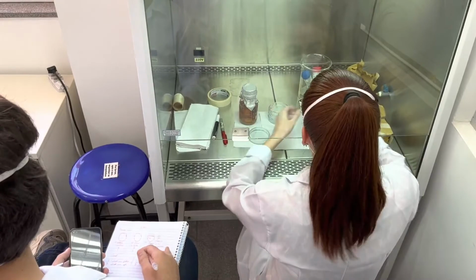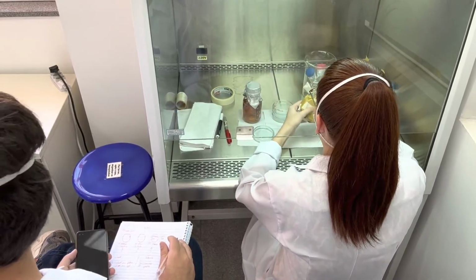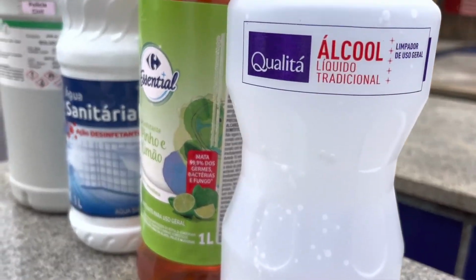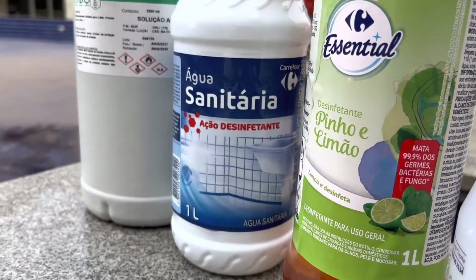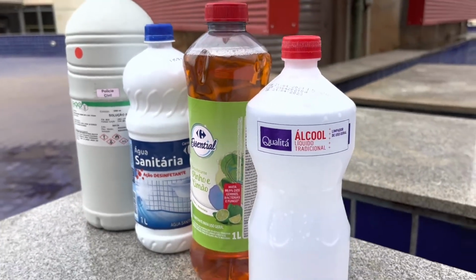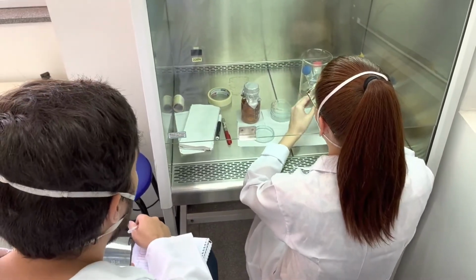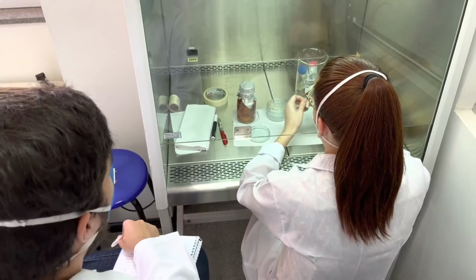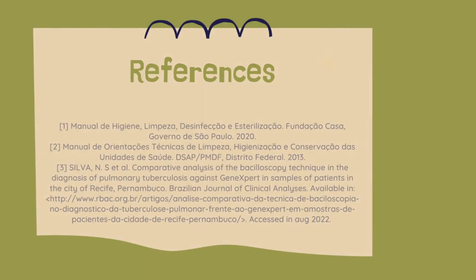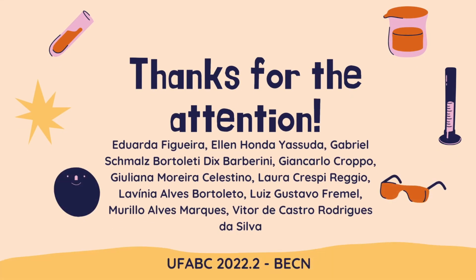Comparing the positive control, which corresponds to the surface before sterilization, with the test area, all tested products showed effectiveness in preventing the growth of microorganisms, although it is necessary to note that the growth before sterilizing the surface has been different for each positive control. It is unknown if the handrail was clean prior to the experiment. This is a factor that may interfere in the effectiveness of these products in other surfaces.